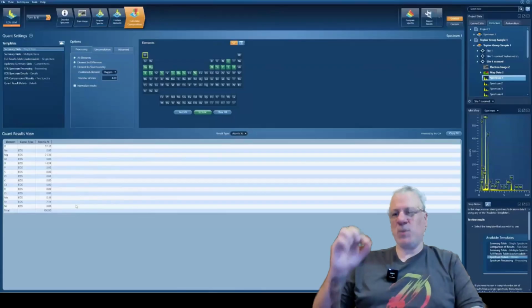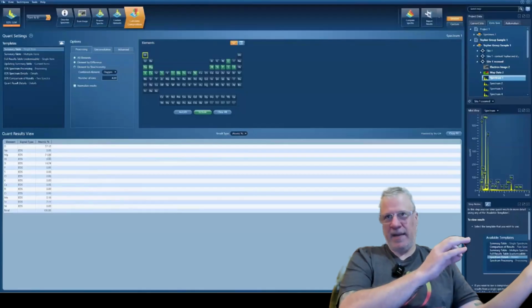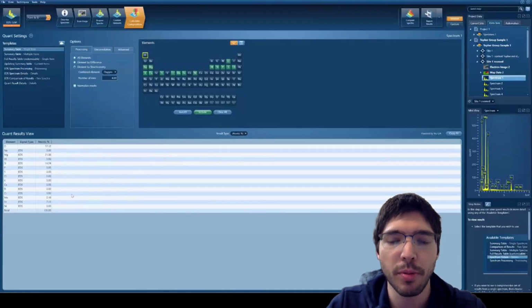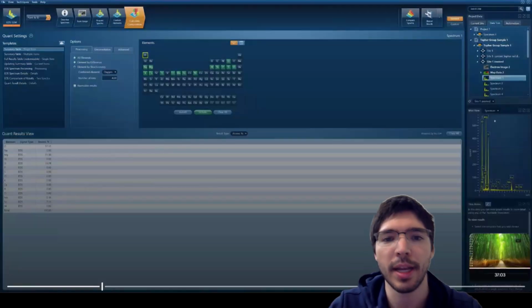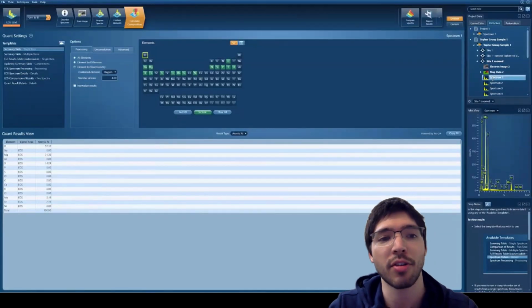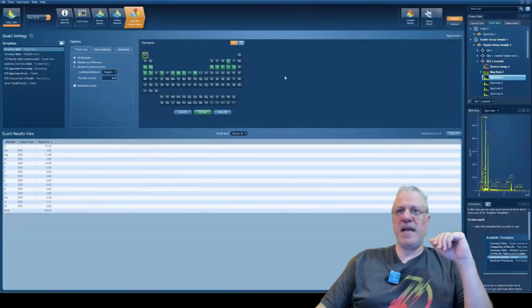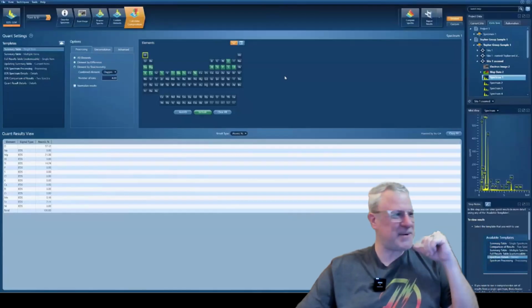But the first actual reading that had carbon in it was excluded that day and not included in your spreadsheet extraction. So it's in there. You'll see it's spectrum two. What I do is when I look at that spectrum, it's still going to get exported. But then when I do the final data cleaning process, when I actually have the spreadsheet, I'll exclude it from any calculations. Fantastic. All right, thank you for clarifying that. I was curious since day one because I knew the data was still there, so I was wondering what was going on.